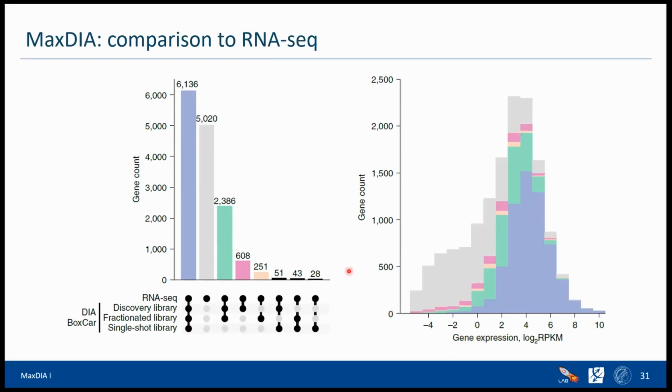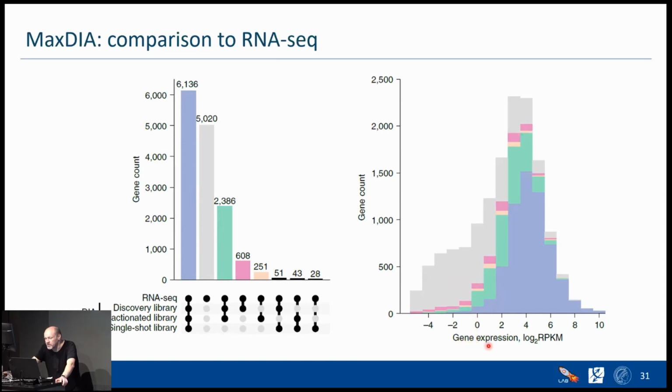So let's look at the histogram first, maybe. This is a histogram where we bin according to the messenger RNA expression, right? So first we pair the data, so we find corresponding mRNA and protein pairs, protein group pairs actually, which is a bit non-trivial, but we will also see this in the multiomics part later, how one does this exactly. And then we make bins according to the mRNA levels, basically. That's what this log2 RPKM is essentially.